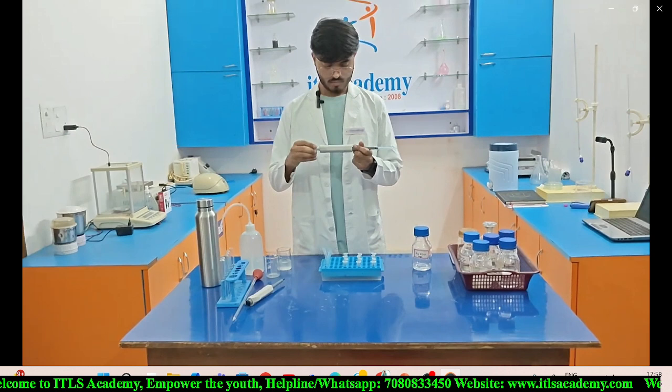We set the micropipette on 500 and now we are going to take the solution and transfer it into each Eppendorf. By the same procedure, we need to transfer the solution into each Eppendorf. Now we have already transferred the solution into each Eppendorf. Now we are going to perform centrifugation, and we need to centrifuge for 2 minutes at full speed.